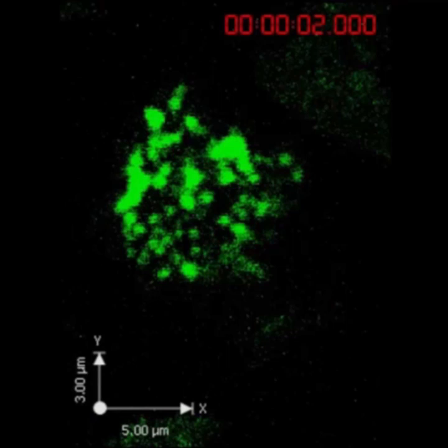What we presented in this study was that we could use these microscopes in order to see in much greater detail what was going on when an NK cell killed a diseased cell.